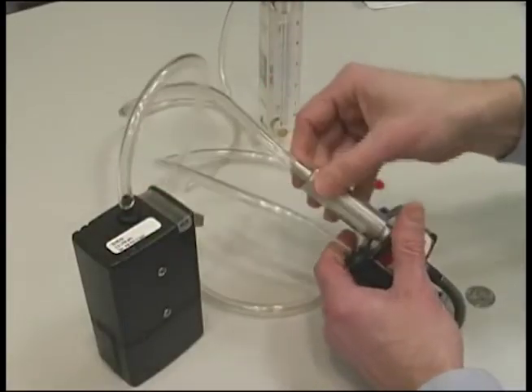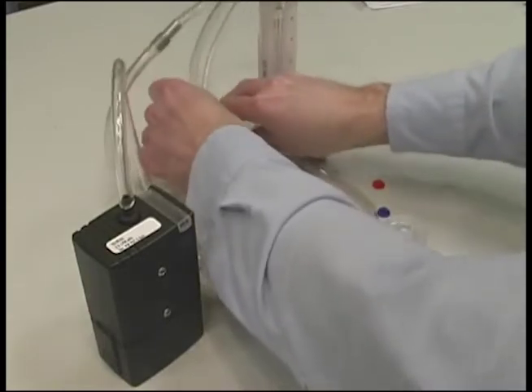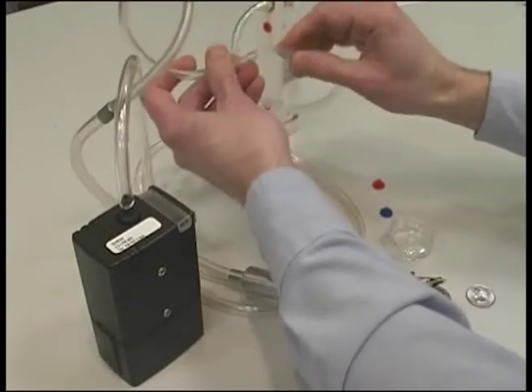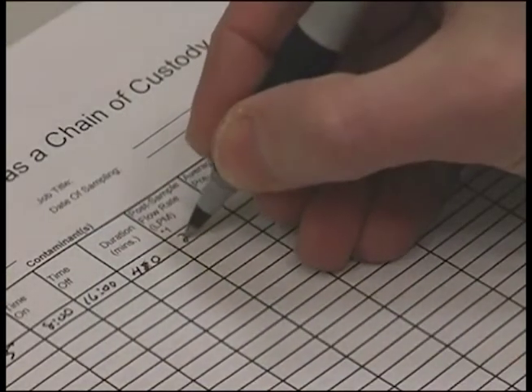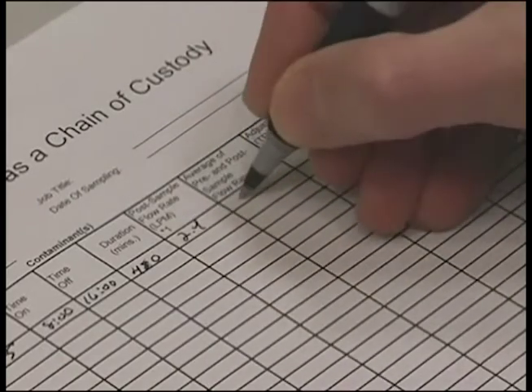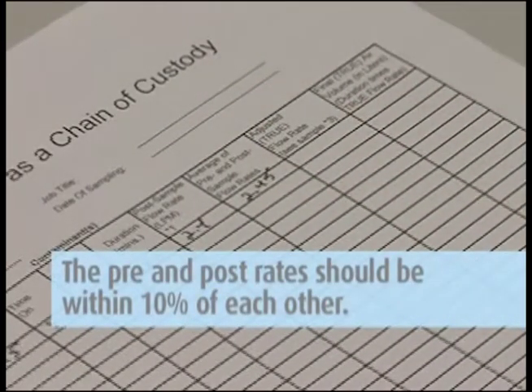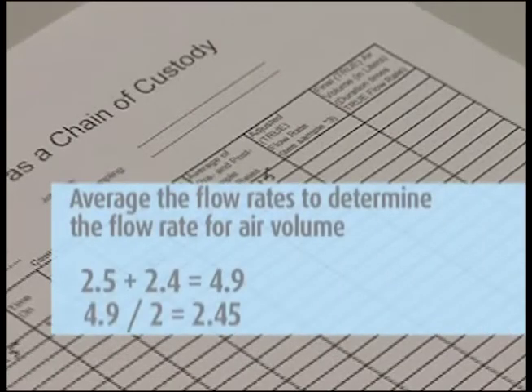After completing the sample, a post-calibration must be performed on the pump. Perform the post-calibration the same way you did the pre-calibration, using the marked calibration cassette, but do not make any adjustments. Just record the flow rate on the pump calibration sheet. The pre- and post-rates should be within 10% of each other. If they are, average the flow rates to determine the flow rate to be used to calculate the air volume.